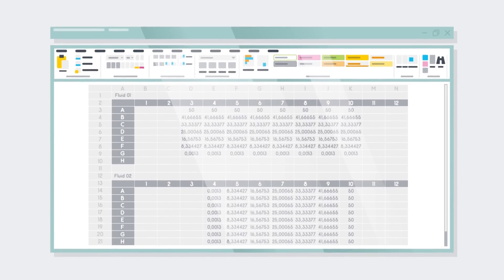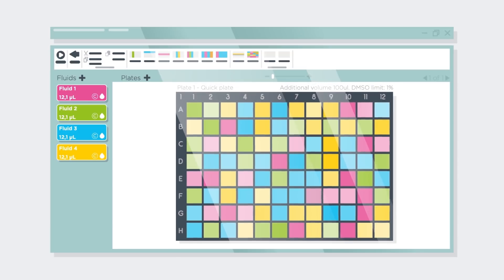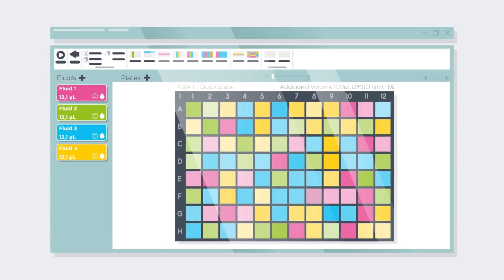Even synergy experiments can be easily set up. You can use different plate formats to save precious samples, and then randomize your layout to minimize location artifacts.